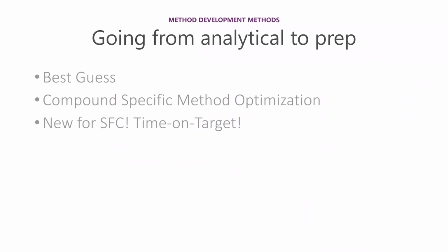There are several ways to go from a scouting run to a preparative method. Very experienced chromatographers can make a good guess for a gradient solvent composition by inspecting the scouting run. Compound-specific method optimization has been successfully transferred from HPLC to SFC. Another technique from HPLC is the time on target algorithm. Time on target is the algorithm behind the gradient optimizer used in AccuPrep HPLC and SFC systems.